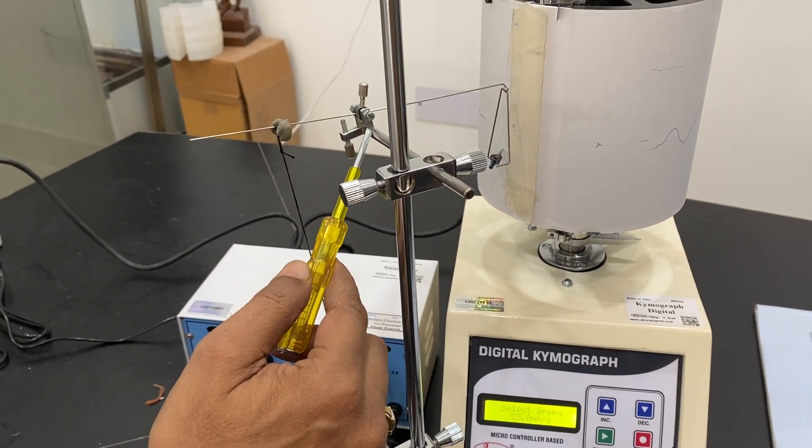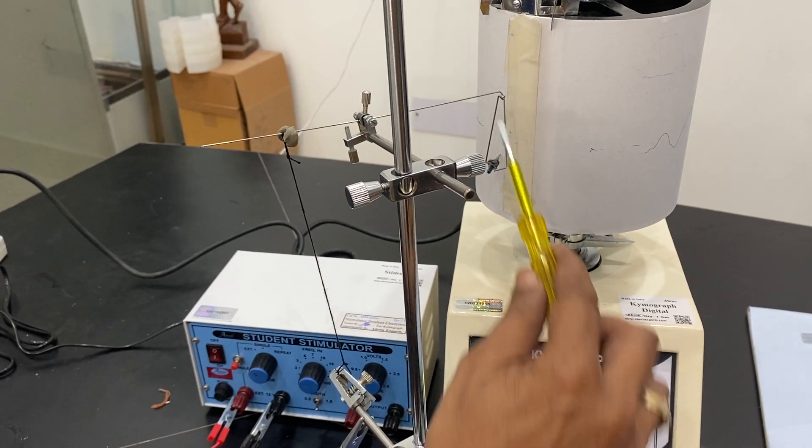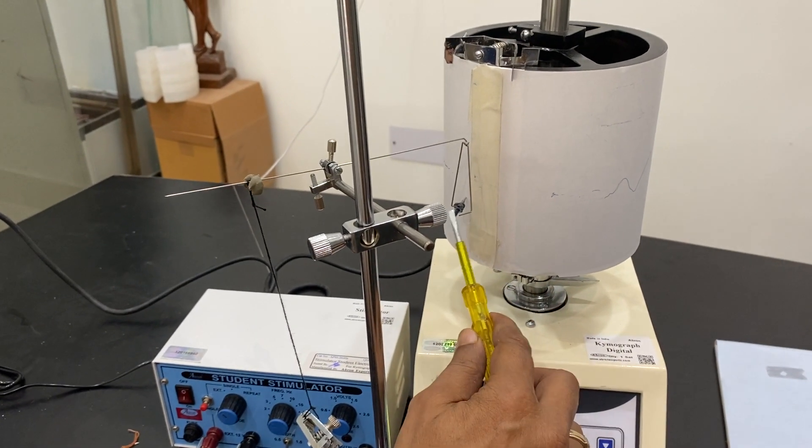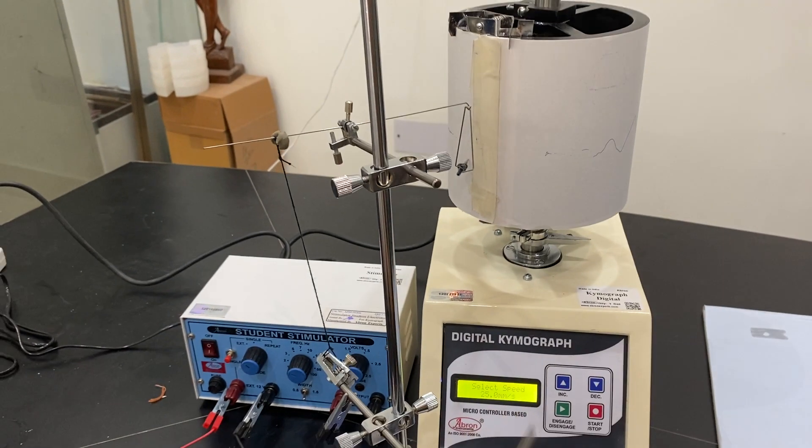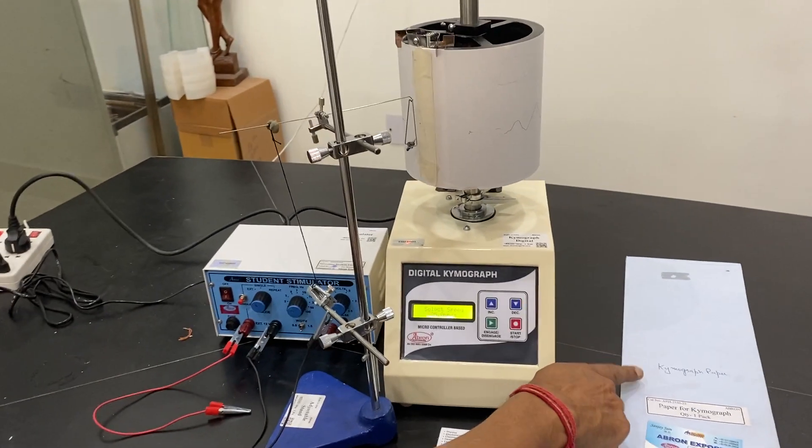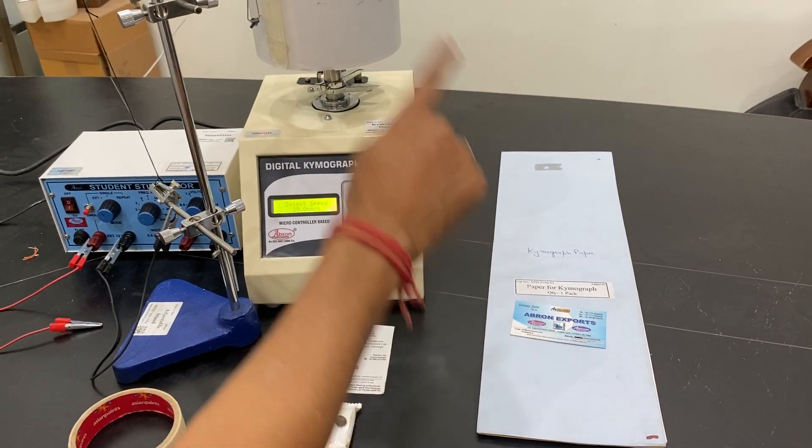We have got a muscle. This is the muscle lever and this is the frontal lever. Now what we have done is we have got the paper which is for the kymograph.